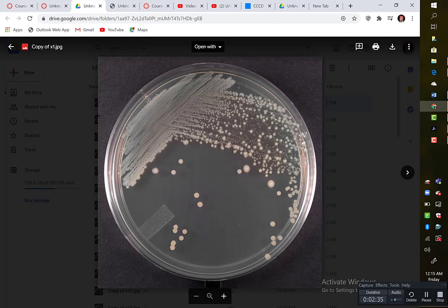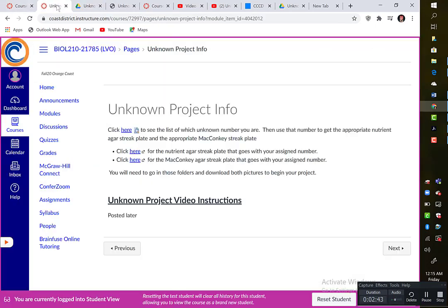So this would be my picture. I would download it and then use that for my report. I would repeat the same process and do that for my MacConkey agar as well.